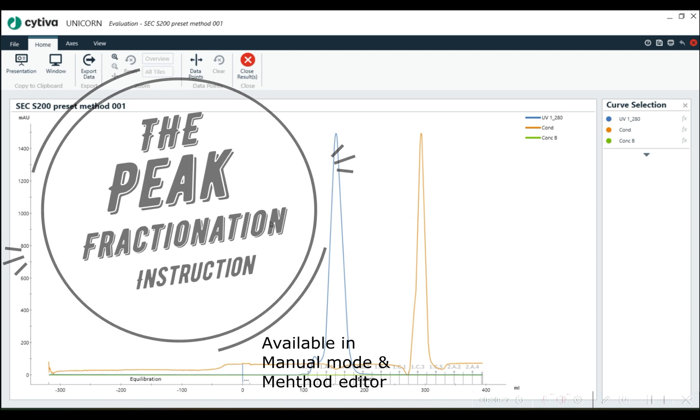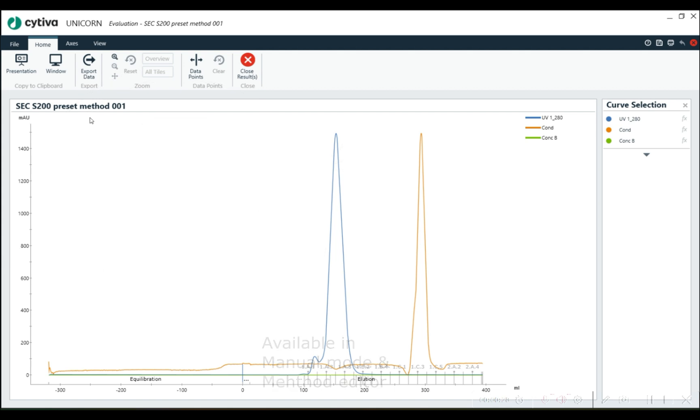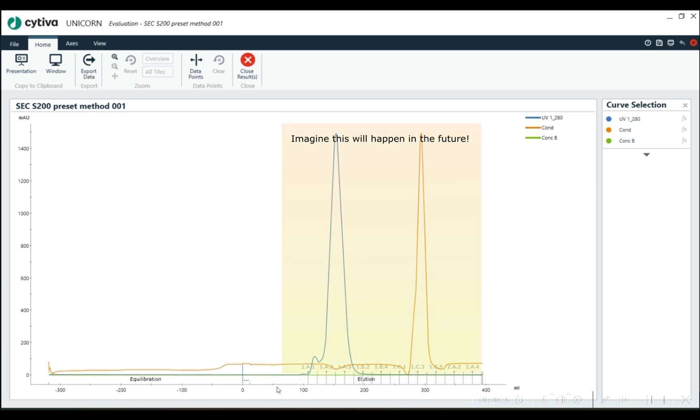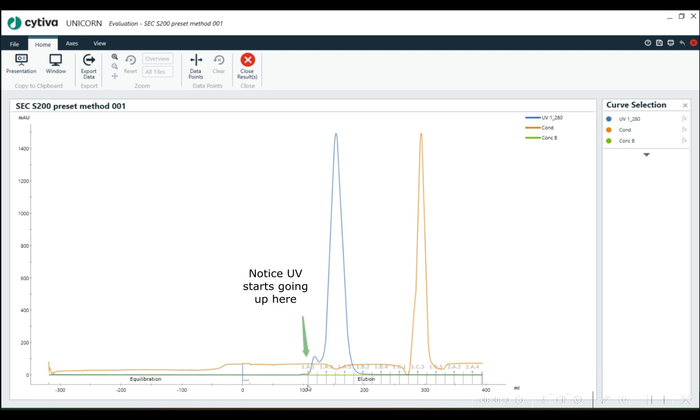Imagine this is an SCC run, and imagine we're actively doing this run right here, and we're at about 50 mils. We know there's a sample that's going to be coming off soon, so right around 100 mils. We are running in a manual mode doing this, and we just decide to hit fractionation, and we just start collecting fractions.